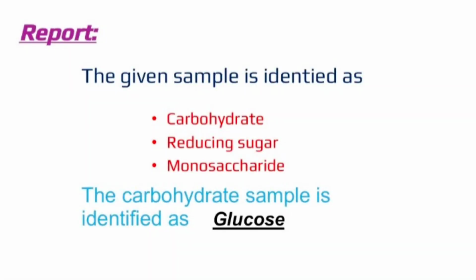Report: the given sample is identified as carbohydrate, reducing sugar, monosaccharide. The carbohydrate sample is identified as glucose.